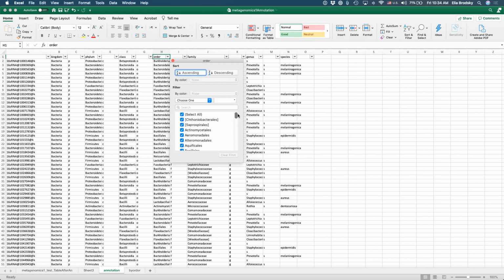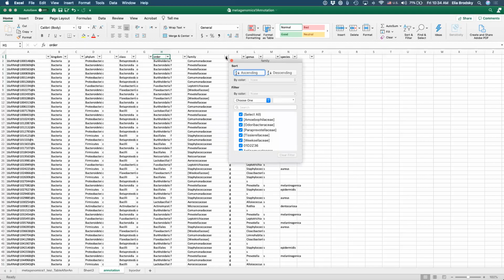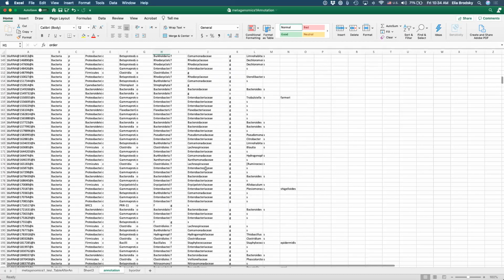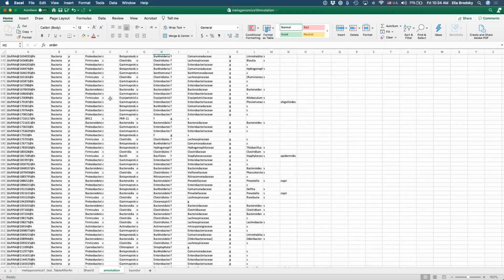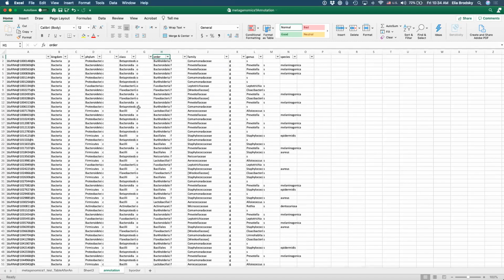For each level of taxonomy, the higher it is, the more I will have full. So this is just important to remember. Here, for example, you can see that you also have a G, right? So here you can see G, G, G, right? So some of them are missing. If they're missing, that means that some of them are just not going to be annotated.